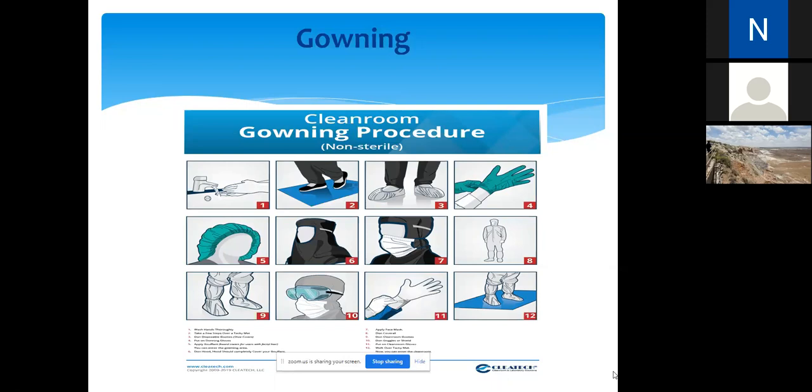Most clean rooms do not have bathrooms, so make sure you get your business taken care of. If you are just starting your clean room adventure, note that it would take a good 8 to 10 minutes to gown properly.